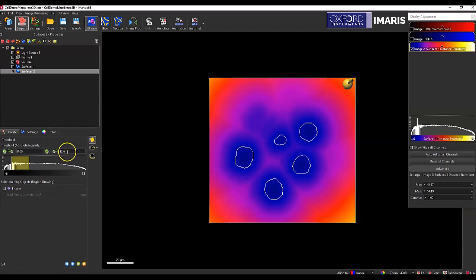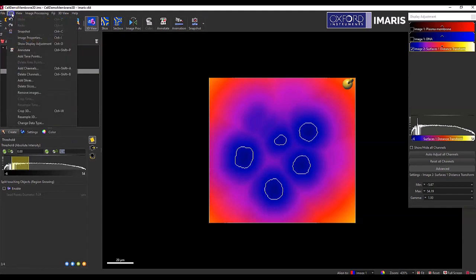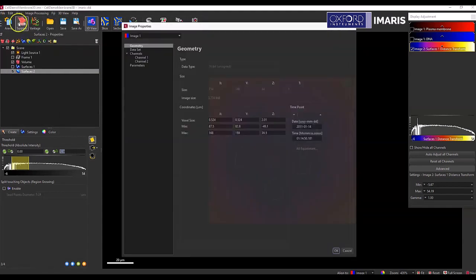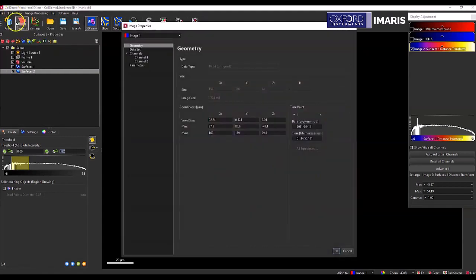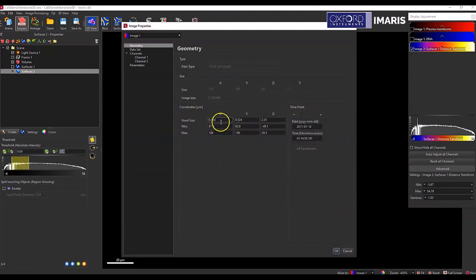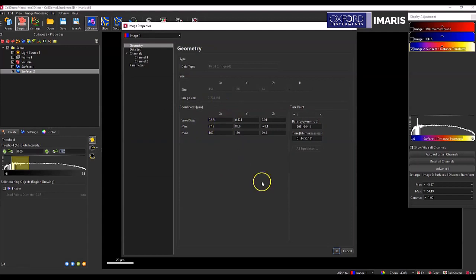So if I want it to be equal to two pixels, this would all be dependent on what my pixel size is. So under edit image properties, you can look at what the pixel size would be. And so my pixel size is about 0.5 microns.